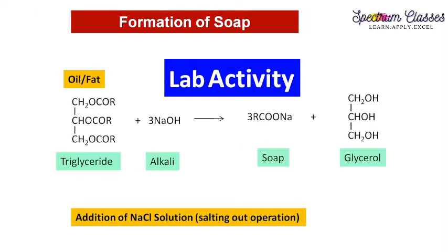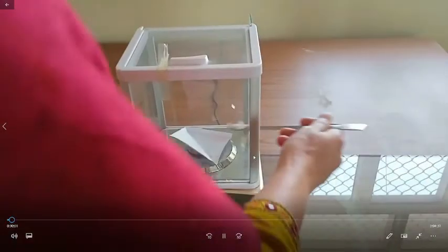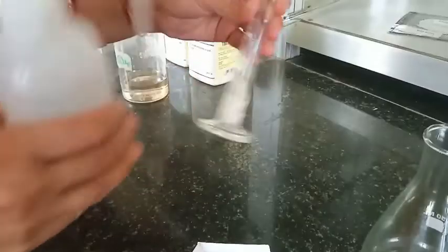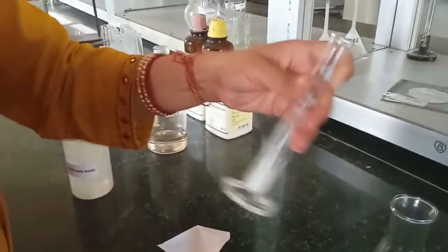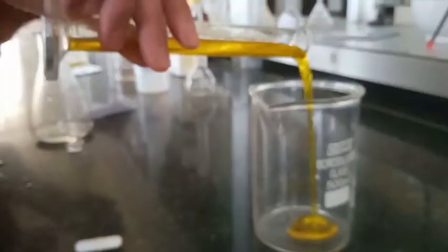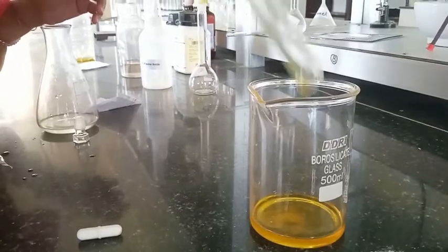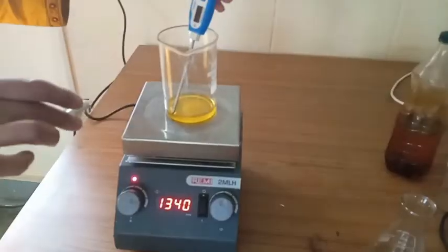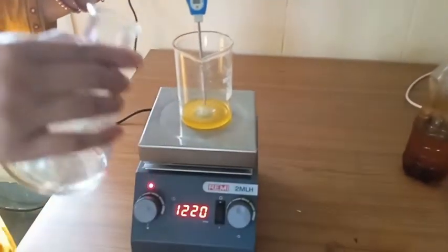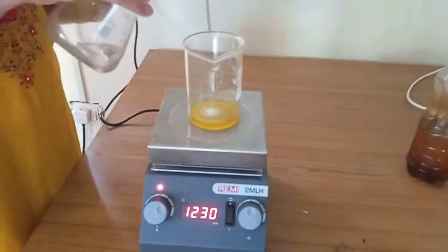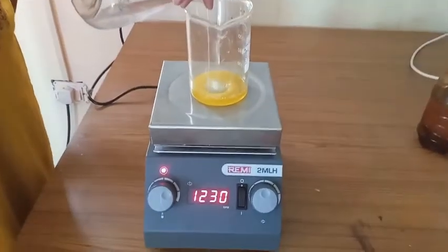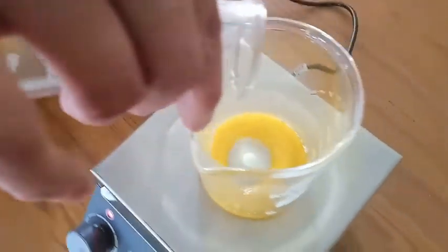Now I'm showing the lab activity for the formation of soap. First, we weigh 5 grams of NaOH to make a 20–30% NaOH solution. Here is 20 ml of mustard oil transferred into a 500 ml beaker. A magnetic needle is added to the mustard oil, which is kept on a hot plate with magnetic stirrer, and slowly we add the NaOH solution.